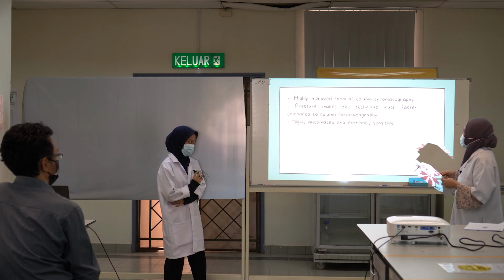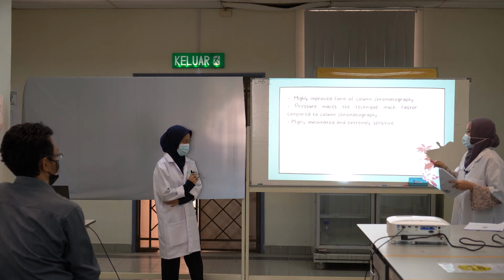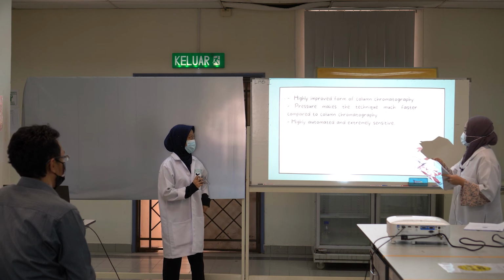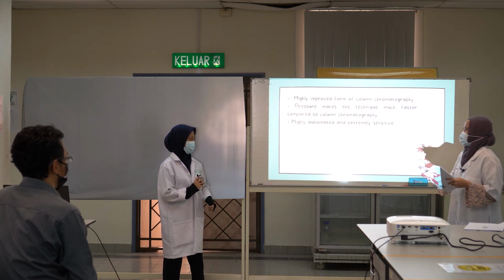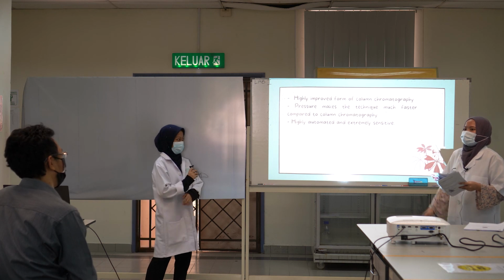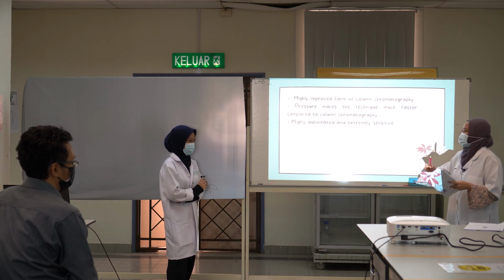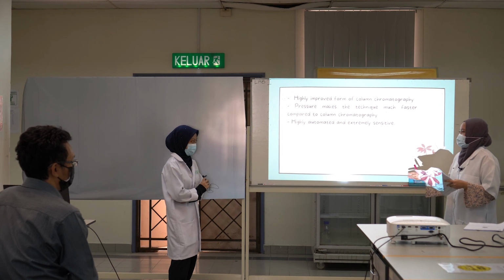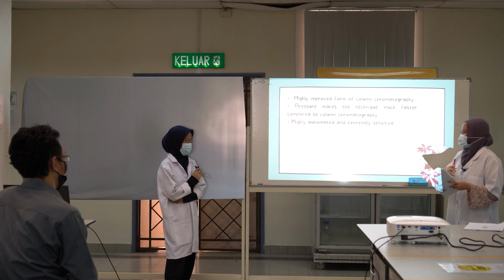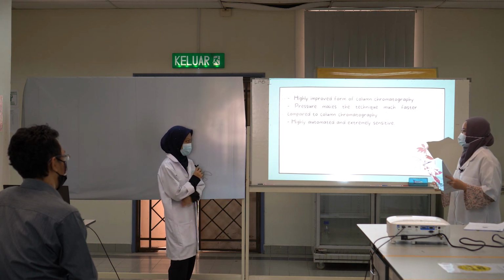When the technologies are more advanced, there will be new specifications. The new specifications mean that it makes things work better than the previous chromatography technique.